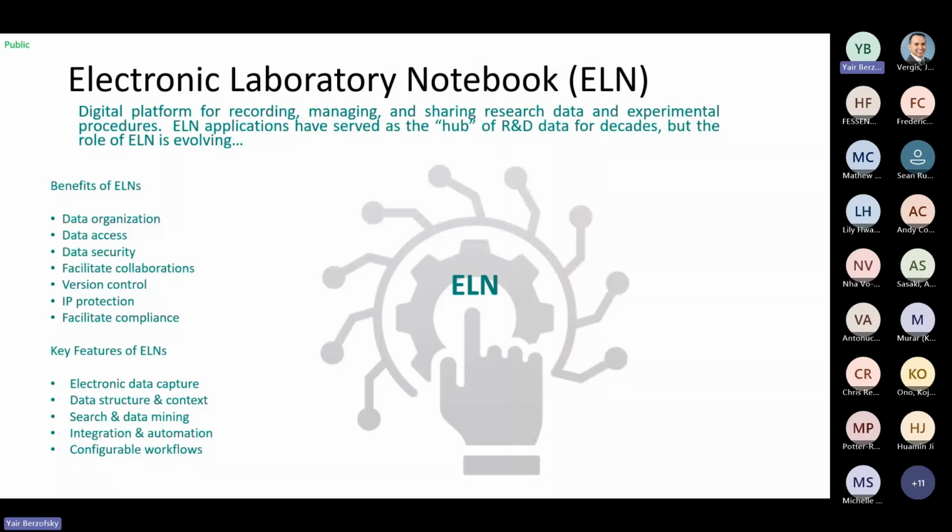Additionally, ELNs have the potential to systematically organize data, making it easier to search for other applications. However, the lack of agreed upon data and architecture patterns across commercially available products has resulted in only a partially connected ELN ecosystem that costs too much to maintain.